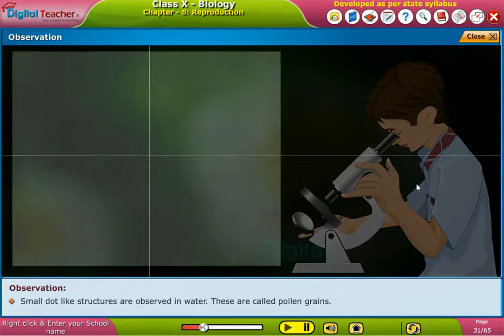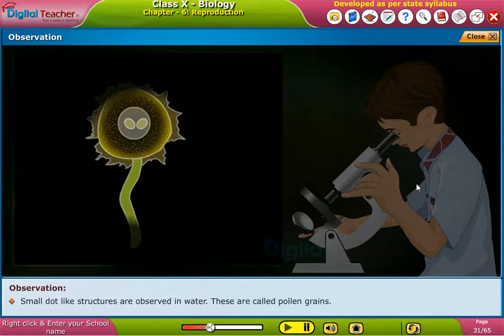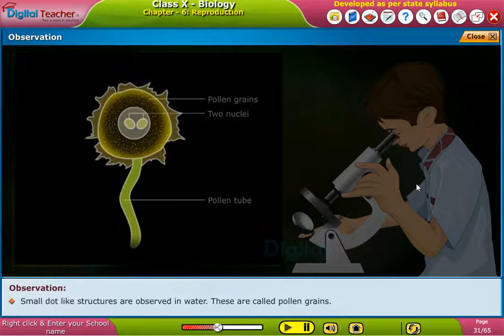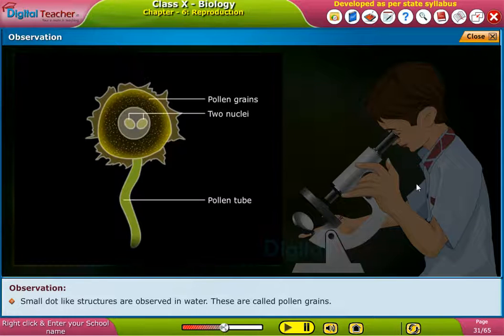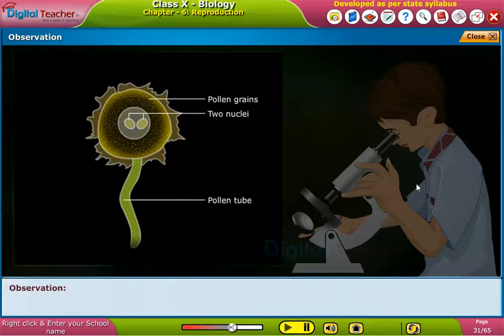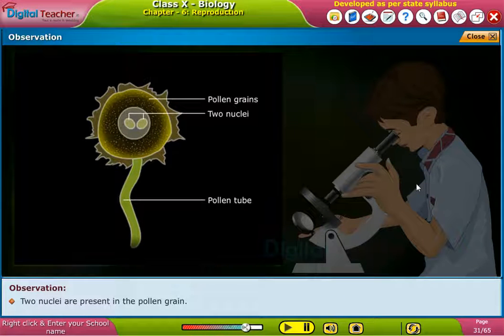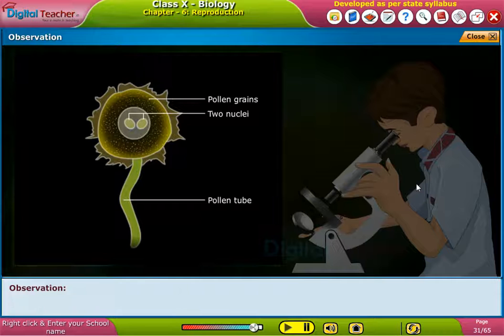Small dot-like structures are observed in water. These are called pollen grains. Two nuclei are present in the pollen grain. It has a pollen tube.